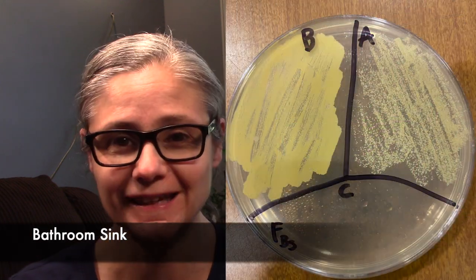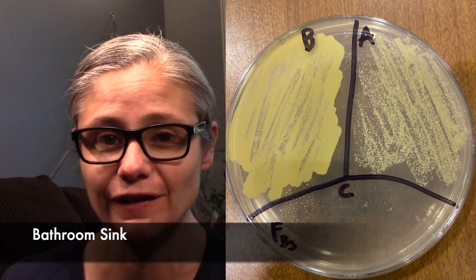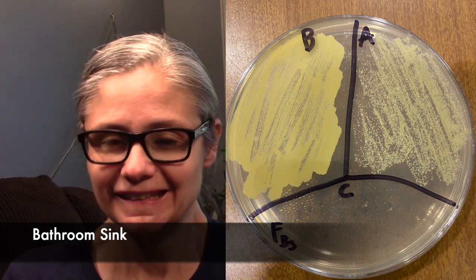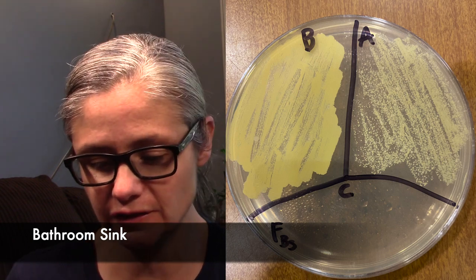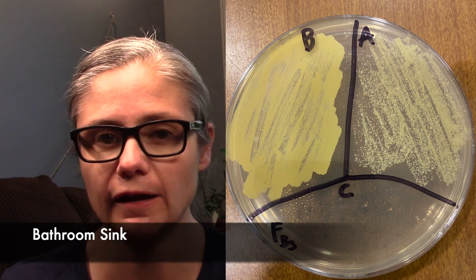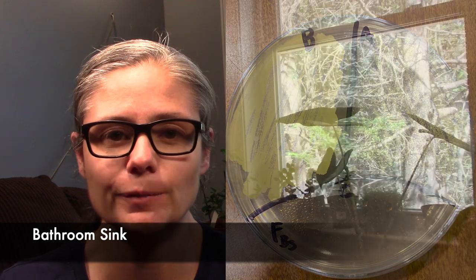Now for some results. The bathroom sink. Let's look at that before section. We have a lot of bacteria there. And then after cleaning with Fabuloso, there's a decrease. Yes, we see a decrease in bacteria. I do not feel it is a significant amount, but there is a decrease. Is it 99.9%? No way, but there is a decrease. So, in my opinion, Fabuloso does an okay job at disinfecting my bathroom sink.